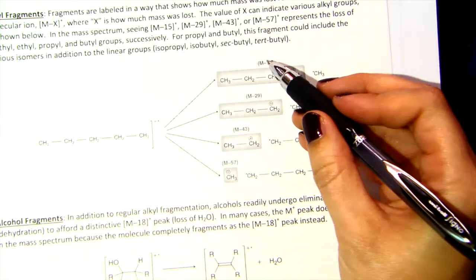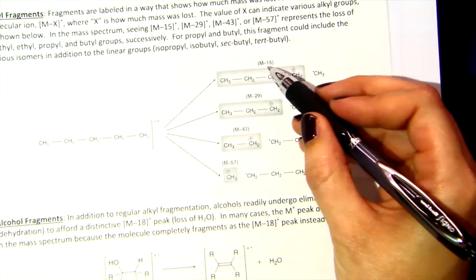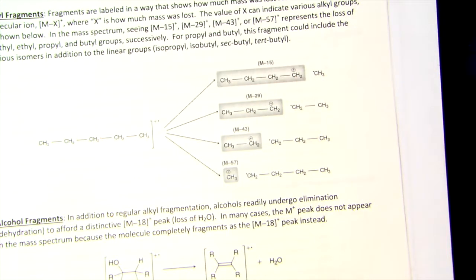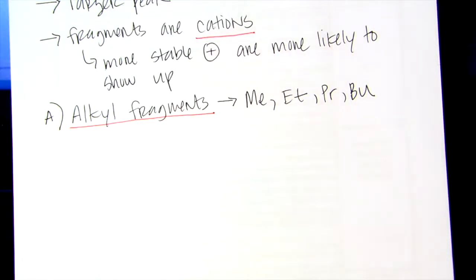Okay, so you'll see those peaks. And again, we're relating the peak to where it is relative to your starting mass peak. So that's how you would label them. Okay, so that's what's going on here. And you don't need to memorize these numbers. If you forget what they are, you can always add up to them. You just know that carbon is 12, hydrogen is 1, and you can figure it out if you don't want to memorize them.